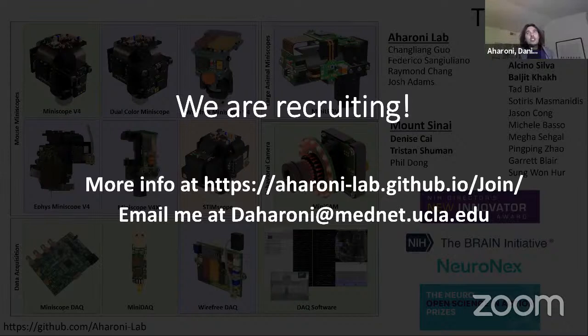So in general, GCaMPs improve every year, and GCaMP8s are ridiculously bright. They are getting faster, more efficient and brighter. So if you wanted the longest recording with the least photo bleaching, the newest generation of GCaMPs is generally the way to go. And the slower the version of the GCaMP is, so going to GCaMP slow instead of GCaMP fast, also has a pretty big impact on the amount of fluorescence you get for the input excitation.